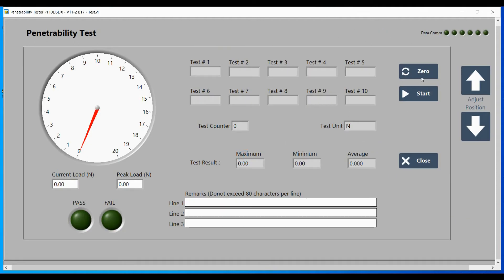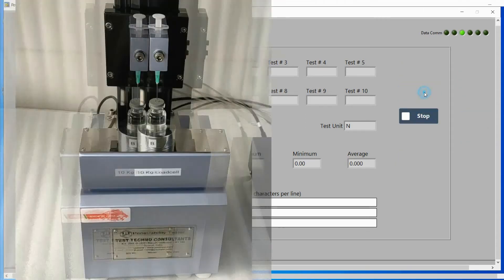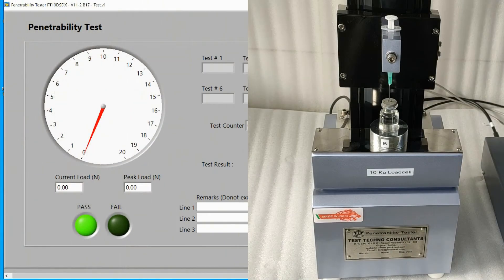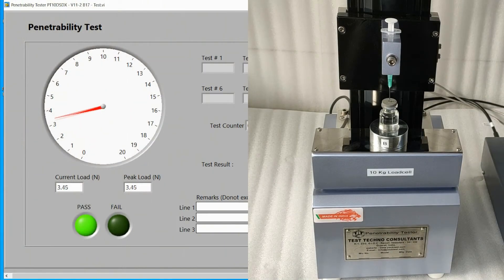Press zero, then press start. Wait for the test to end.